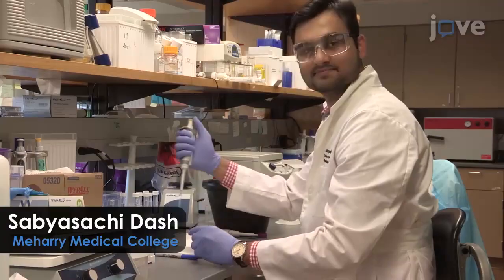By identifying the targets of the microRNAs — those are the mRNAs — we can certainly provide critical knowledge that will be important for discovery and therapeutics. Demonstrating the protocol will be Sabyasachi Das, a graduate student from our laboratory.